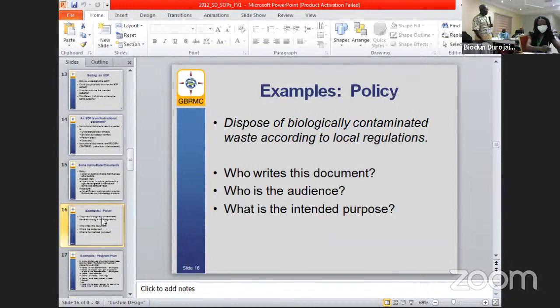And so they are talking to my head of department, or the head of the scientist in my department, to make sure that all biological agents were appropriately decontaminated. And so it now becomes the business of the head of department, maybe instructing the head of the scientist to please draft an SOP and ensure that some individuals are designated to achieve that.